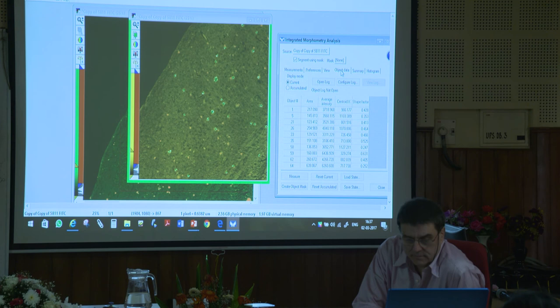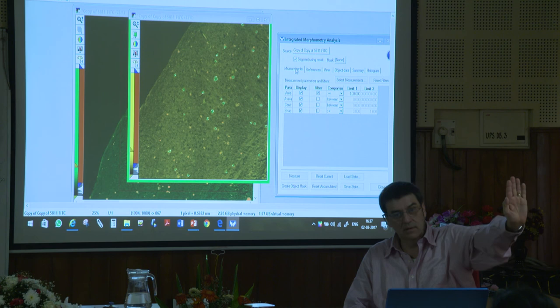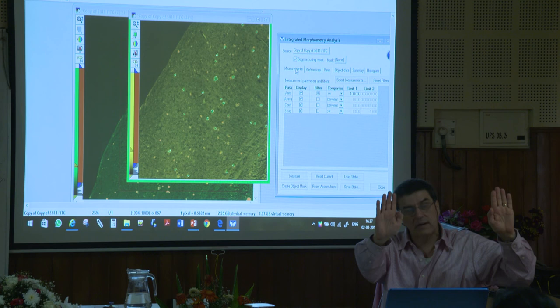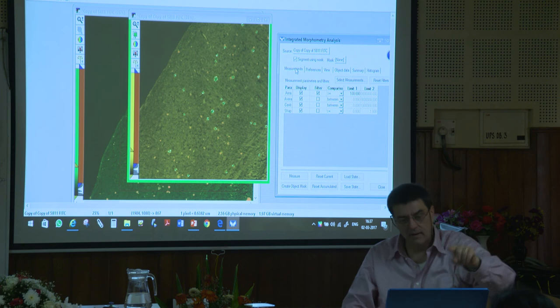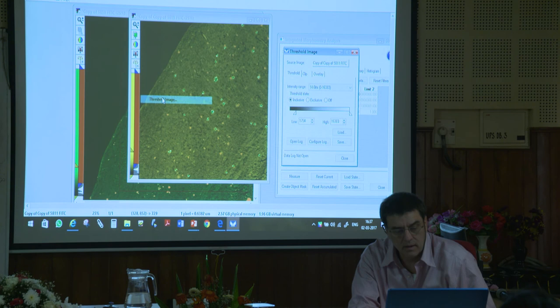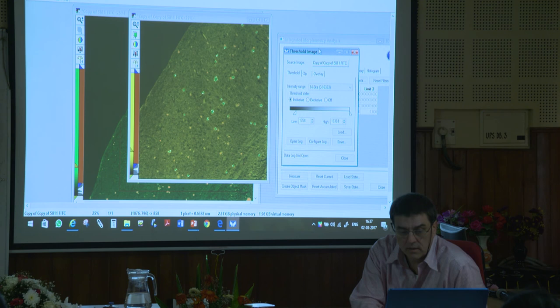Now, if I took my picture of my mouse that was not treated with any drugs, and then I took my picture of my mouse that was treated with the drug, and I did the same staining to both of them. I did the same staining on the same day to look at the plaques. And then I used the microscope the same way and took the pictures exactly the same way. I applied the same threshold to both images, right? And I used the same size sort we just did. I keep everything the same.